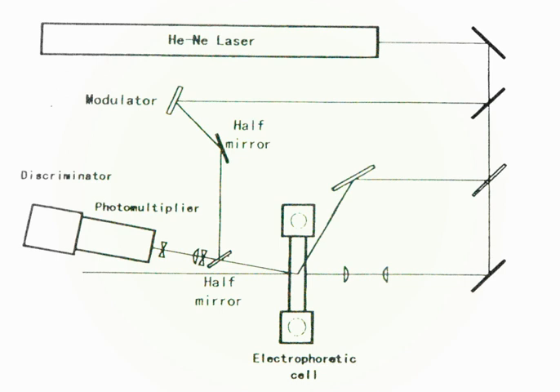Electrophoretic mobility analysis has been studied by Mori and Okamoto, 16, who have taken into account the effect of electro-osmotic flow at the sidewall. The profile of velocity or mobility at the center of the cell is given approximately by EQ 11 for the case where k is greater than 5.